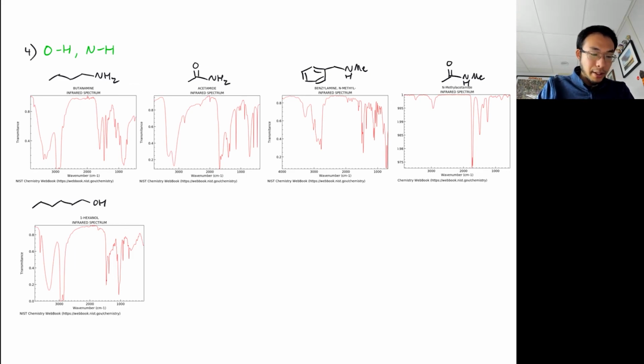And the confusing part here is that there are two different OH stretches that show up. There is the big broad one that I already pointed out, which is right here, and then the little sharp one that's right there. And these are both related to the alcohol in the hexanol molecule. The difference is that we're seeing the hydrogen bonding effects showing up. So the reason we get really broad peaks for alcohols and amines is that we're doing a lot of hydrogen bonding with these molecules.